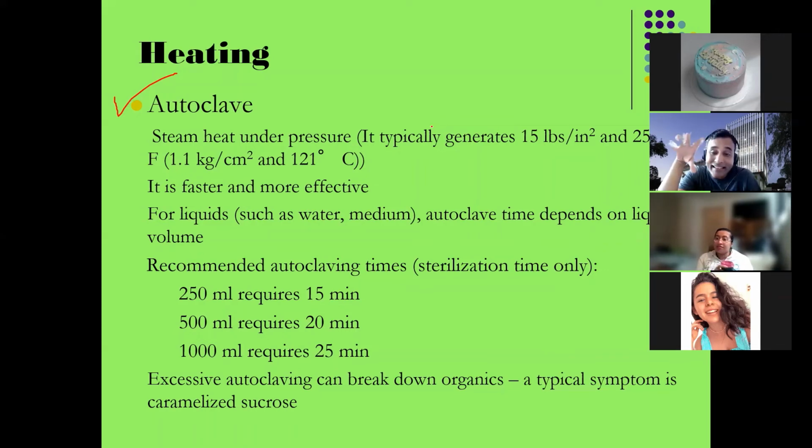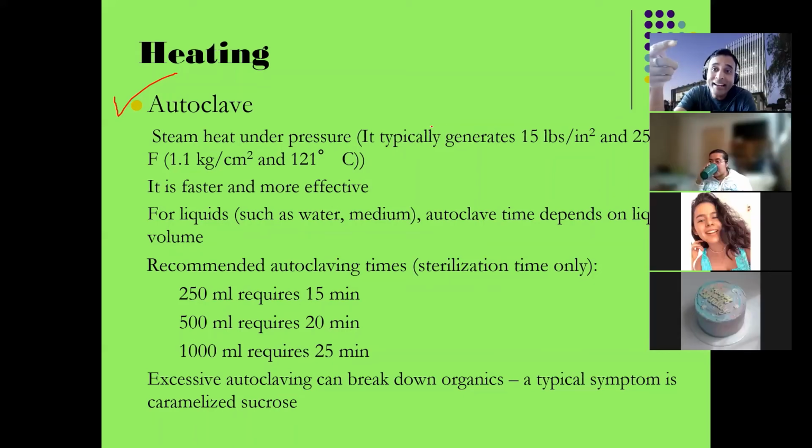The most important thing in this whole autoclave technique is that steam is the main key player, because steam, you know, has more heat than the heat. You understand what my point is? If you put your finger in a candle, you can put it like this. This is the candle, right? This is the lighter. You see my lighter? You see my fire or not? Oh, I cannot see fire. Why? You see fire? Oh yeah. So I can put my finger like this.